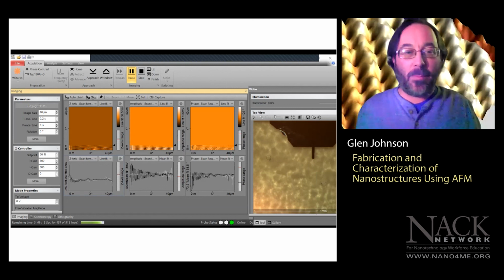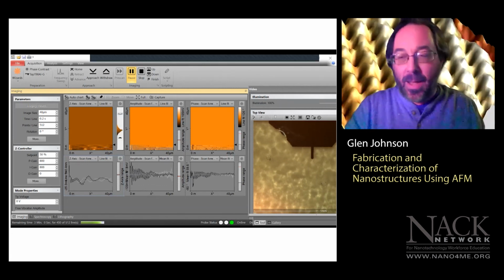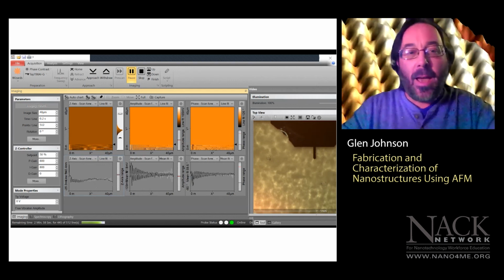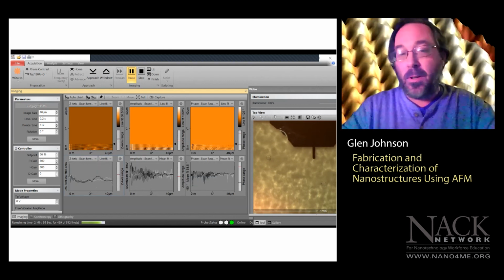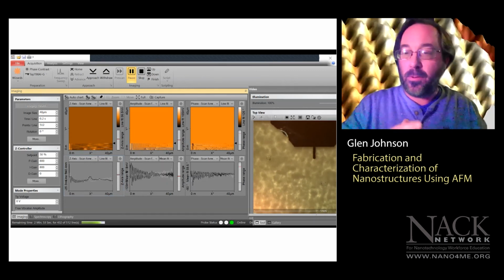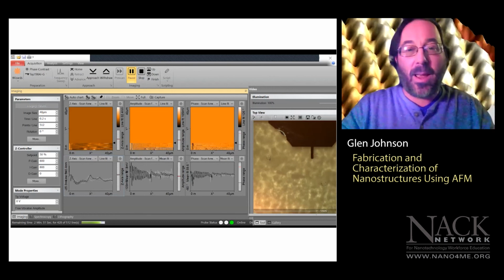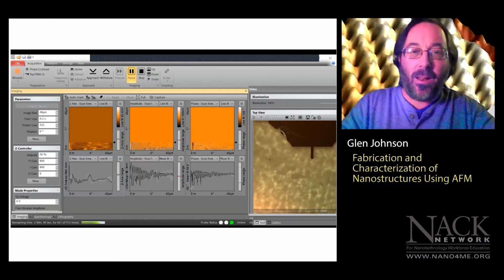Like I said, I'm in my basement. I'm not in the lab setting. It's not the cleanest sample because I don't have a sonicator, so there's debris on it. And you'll see some of these bright specks. Those are taller features. So that's when we look at topography, that's how we can point out taller features as bright and dark.